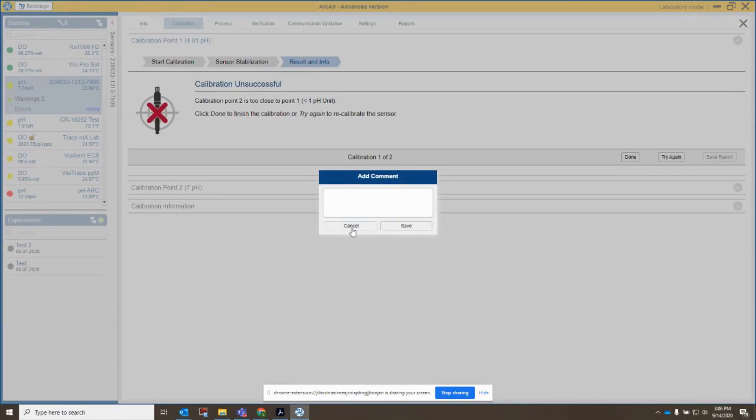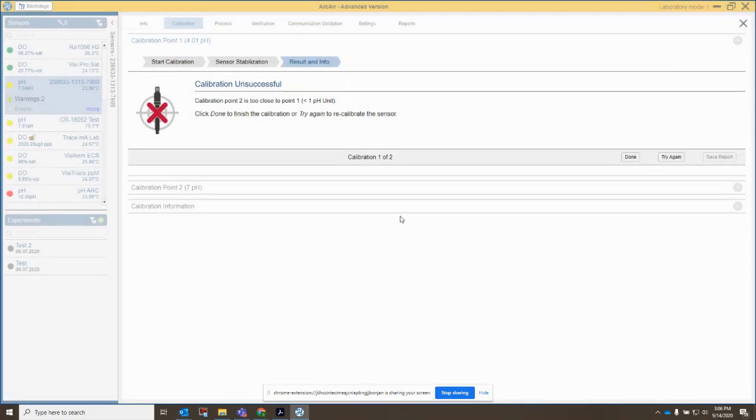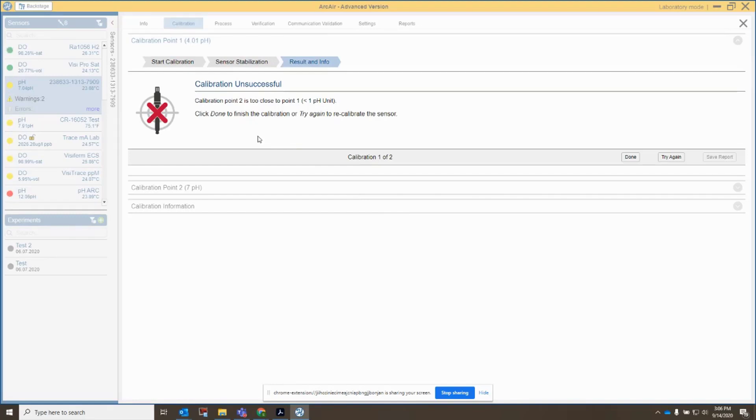It says add comment. It says calibration point 2 is too close to point 1, less than one pH unit. So I failed my calibration, and that's because I'm trying to calibrate at a point that is exactly the same as my second point, and so that's a problem. You need to have at least a difference of one pH unit to do a proper calibration.